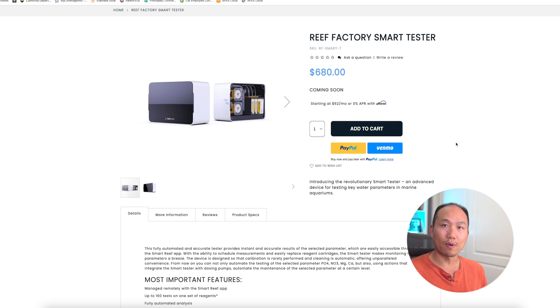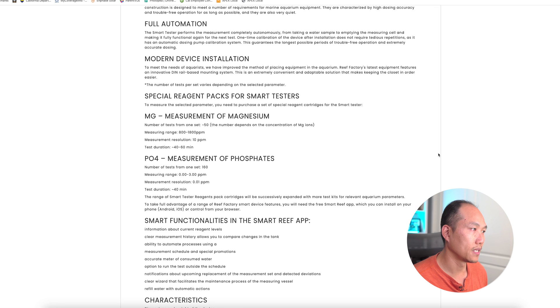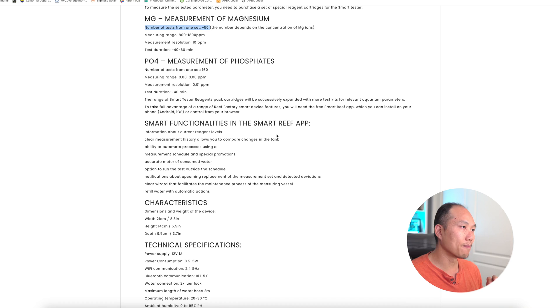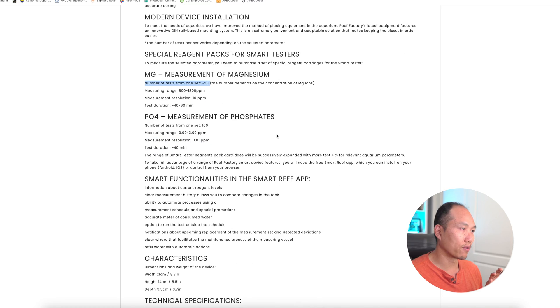Looking at the PO4 measurements, you get about 160 tests out of the reagent set. For magnesium, you're only getting about 50 tests. So if you were to get this unit, I would personally say just get it for the PO4 testing.